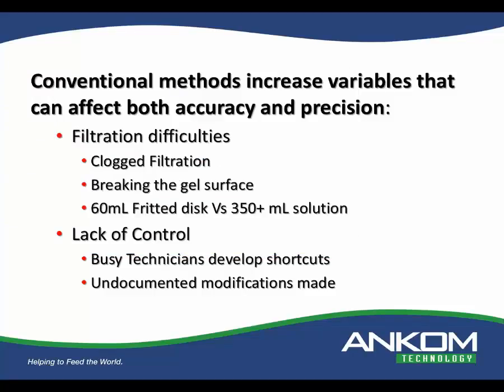Likewise, it is pretty common for us to talk to people about the method they're running, and let's say they're telling us they're running 991.43, and we ask them to walk us through how they do it, and suddenly we hear them saying things that aren't in the method. And then when we ask them why, I can think of one example right now where they increase the temperature, I believe after the 3 digestion phases, to 100 degrees before they go into the filtration phase. And I asked them, why are you increasing that temperature?